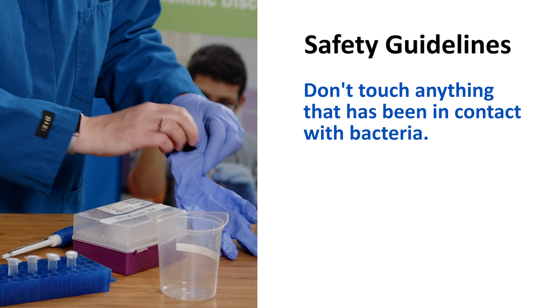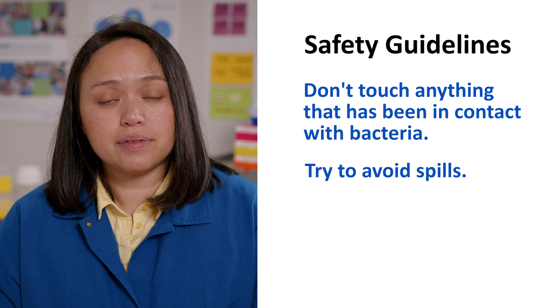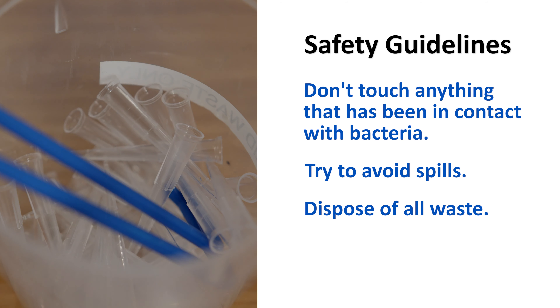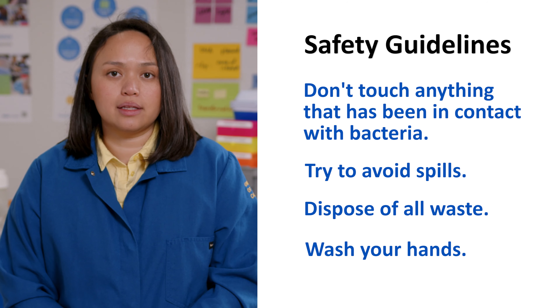This means you can't touch anything that has been in contact with bacteria. Try to avoid spills, but if something does spill, notify your teacher right away. Dispose of all tips, used tubes, and spreaders in a waste container as directed by your teacher. Wash your hands before and after conducting the lab.